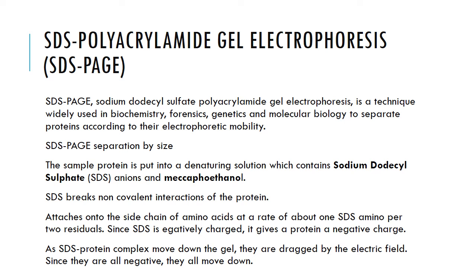So now this SDS-protein complex will be moving down the gel. They will be dragged down by the electric field that is being produced, since we connected the device to the source, which happens to be the battery in this case, which is providing the constant electric field. Since they are all negatively charged, remember what we said? Downwards below, they're supposed to be positively charged. They will all now be forced to move downwards. All the proteins will be forced to move downward.